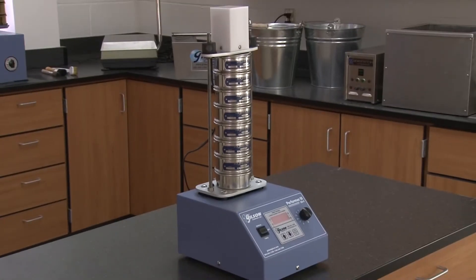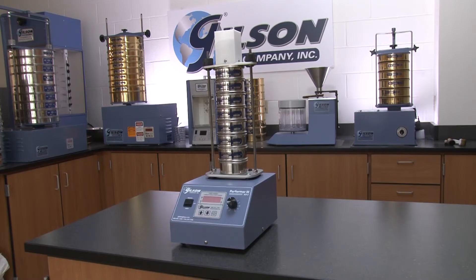And to match your unique material analysis needs, the Performer 3 can be configured to a vibration-only or a tapping-only test method.